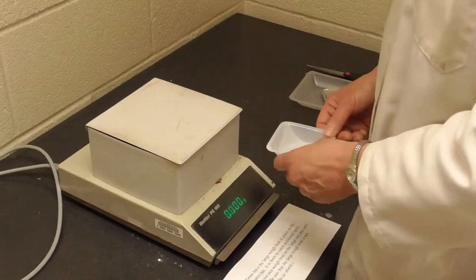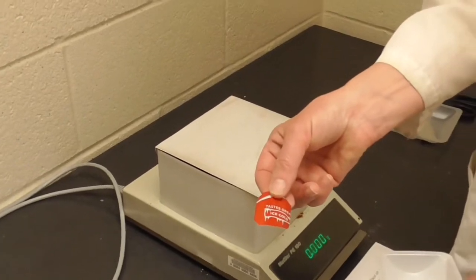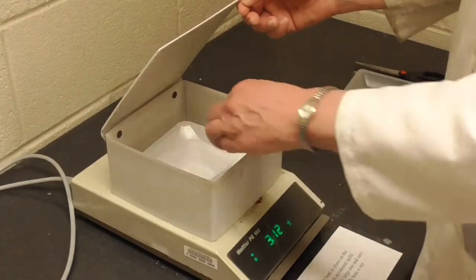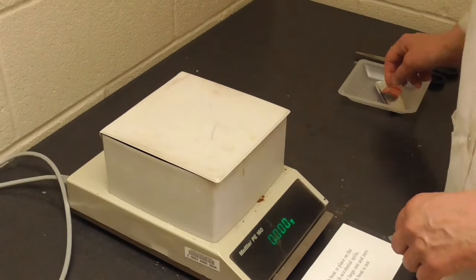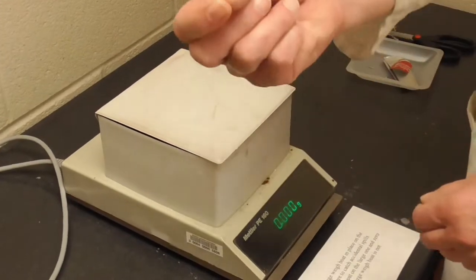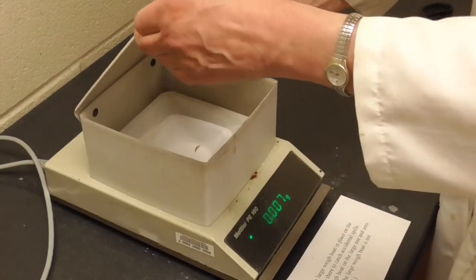Okay, I have already cut a few pieces of the pop can, soda can, and so I'm going to first put the weigh boat in the balance and zero it out. And now I have a very small piece of the pop can, but that's not enough. We need about 0.025.